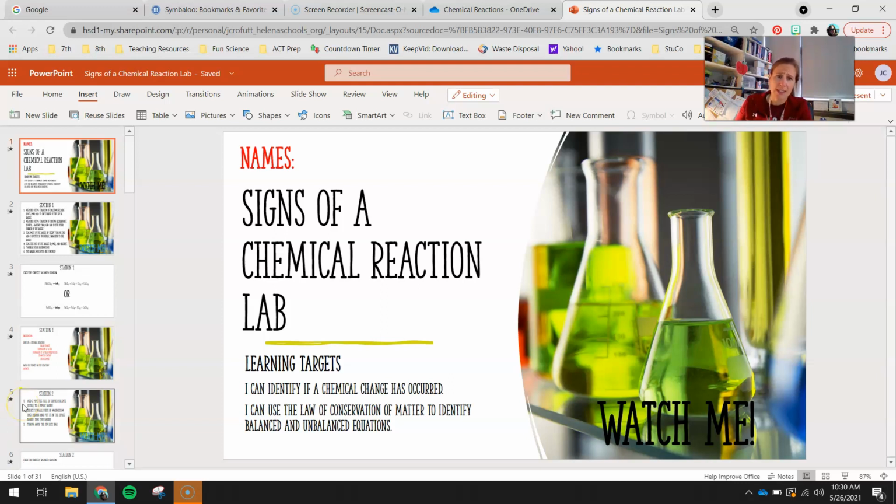All right, so this is the Signs of a Chemical Reaction lab. Our last assignment that we did last week talked about the 5 different signs of a chemical reaction. So you guys will have a second to review those here. Those should also be in your OneNote.